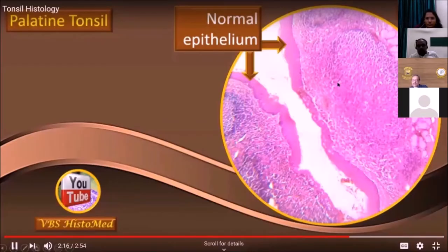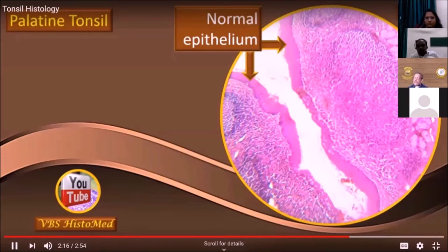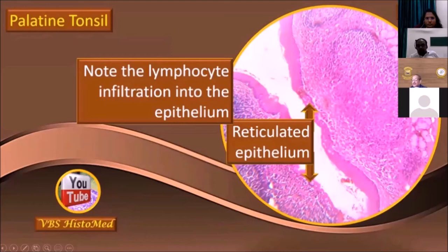Next, palatine tonsil. I would like to caution all my students that this is probably the one structure where the same epithelium is seen in two avatars. One is the normal epithelium, just like anywhere else in the mouth cavity — stratified squamous non-keratinized epithelium. This is also the structure where a very interesting variant, namely the reticulated epithelium, is also visible.